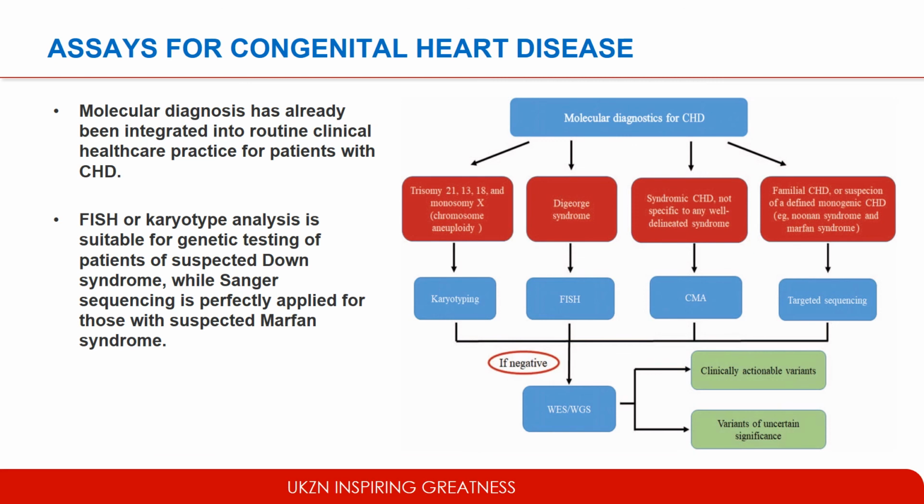With targeted sequencing, if the researcher knows the specific gene that carries the mutation responsible for causing the disease, that specific gene is amplified by normal PCR. It is then sent for Sanger sequencing, and mutations can be detected, as shown in the study with type 2 diabetes. They would look to see if the specific mutations are present.